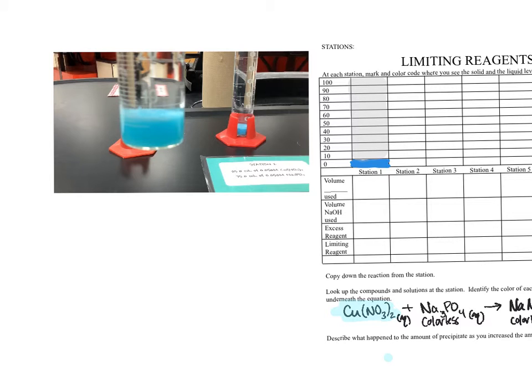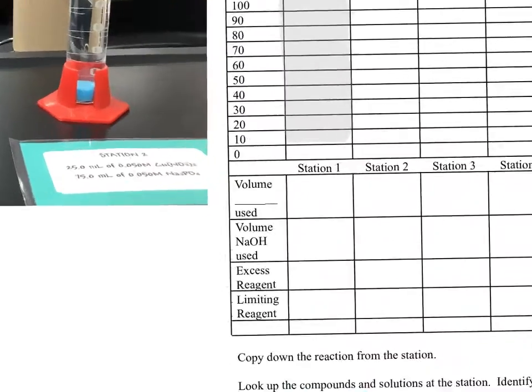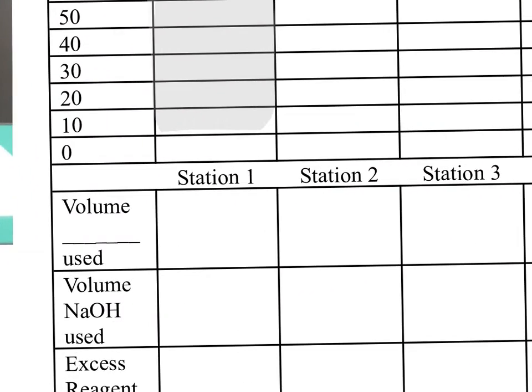In fact, I may drop this down just a little bit more. Let me see if I can make it a little bit more fine-tuned here. We're in here a little bit. And then we've got our colorless solution on top there.